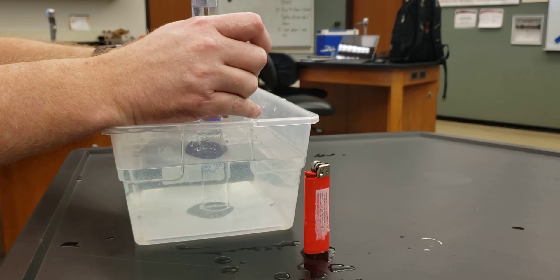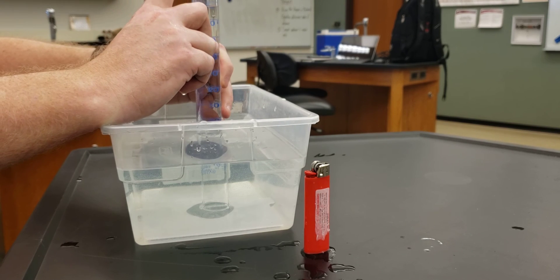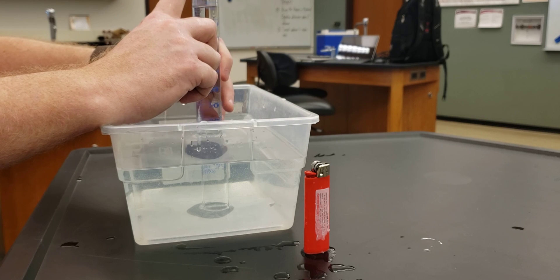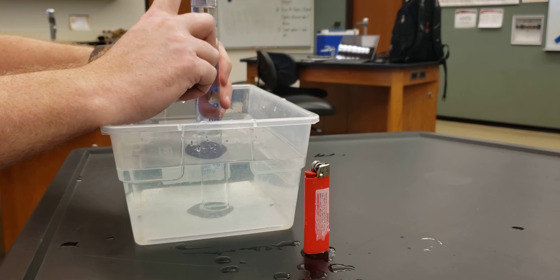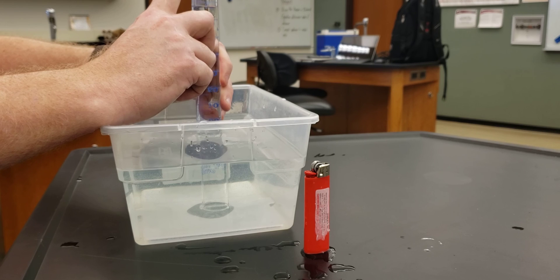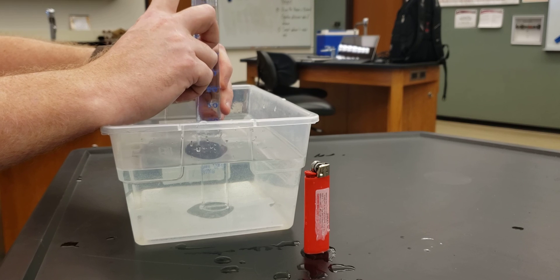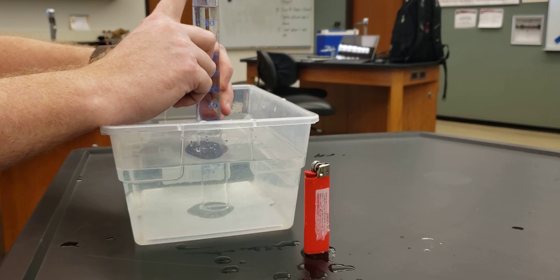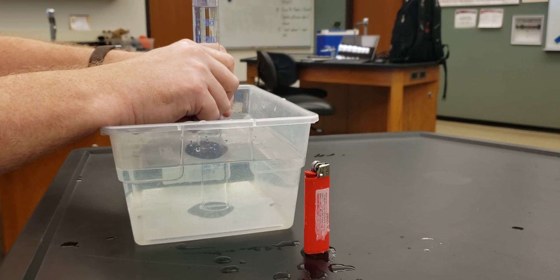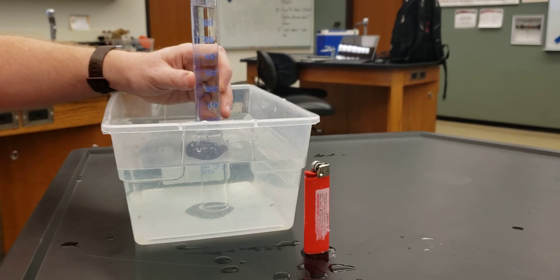You're going to take the temperature of the water to determine the vapor pressure of the water above the water in the butane, and then subtract that from the pressure you get to get the pressure of the butane. All right? So that's how you do the lab on molar mass of butane.